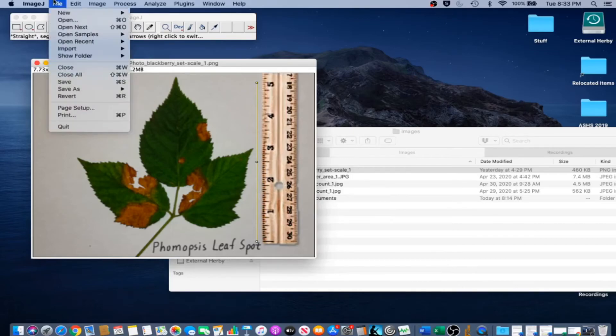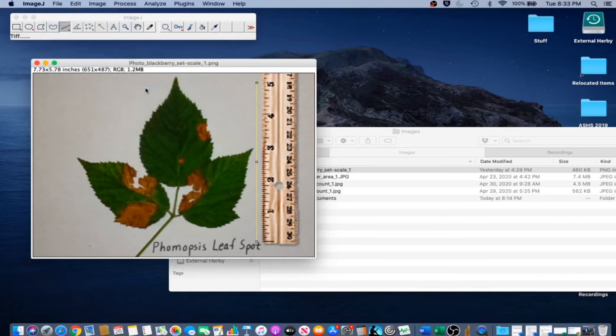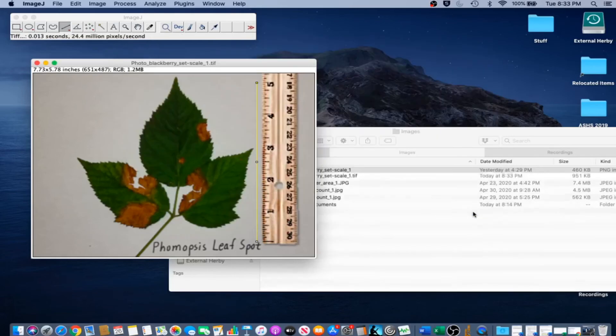We're going to save a copy of this scaled image because we're going to use it later. You can go to File, Save As, TIFF, and just go ahead and save.